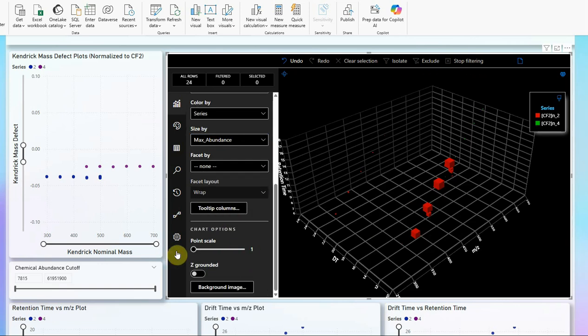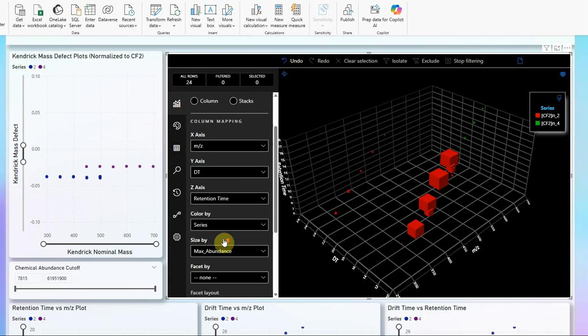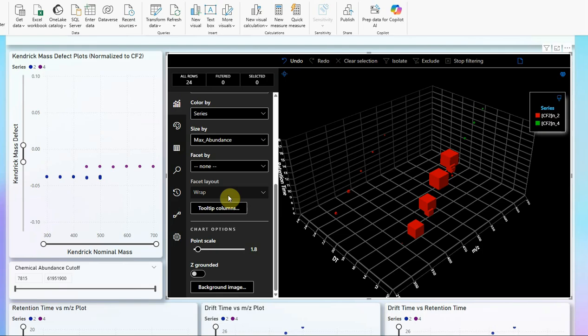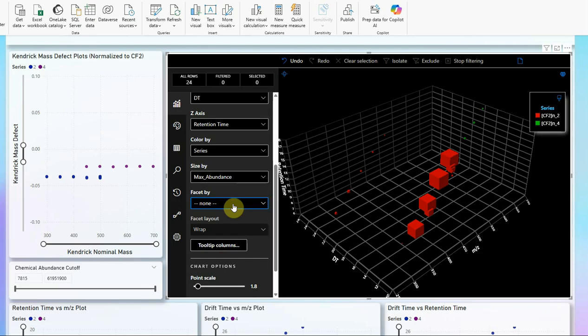All right. So you can play around. There's a lot of options in this. I do want to mention, and I'll show it at the end, but there are a few options that, if you select them, will freeze the software. Not our fault. We're mooching off this graph, so we didn't create it. For example, one is the facet by, so we'll show it at the end, but it will freeze your software if you try to undo it.